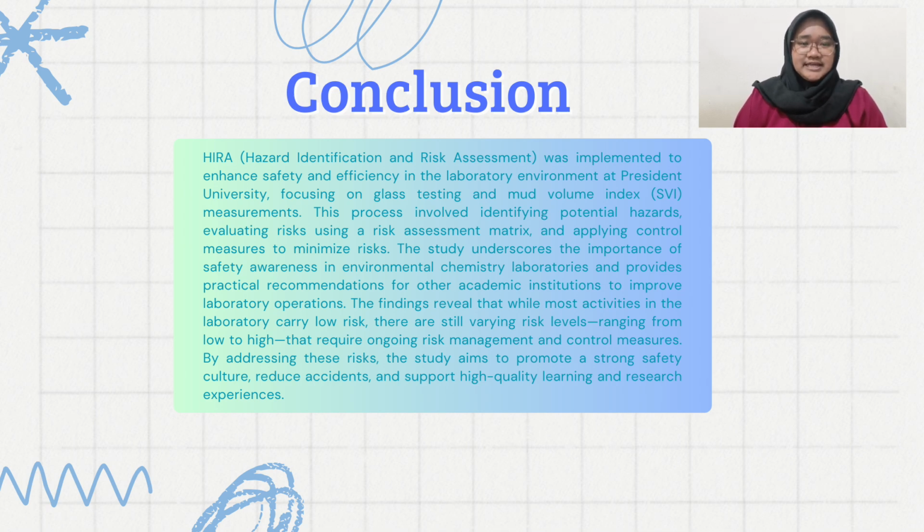According to the study findings, laboratory safety can be greatly improved by employing HIRADC for proactive risk management. To guarantee that all staff members are prepared to handle risk efficiently, it is advised that HIRADC training be standardized and incorporated into the laboratory curriculum. The report also recommends that the safety procedures be evaluated and revised on a regular basis to account for new technology or developing dangers.